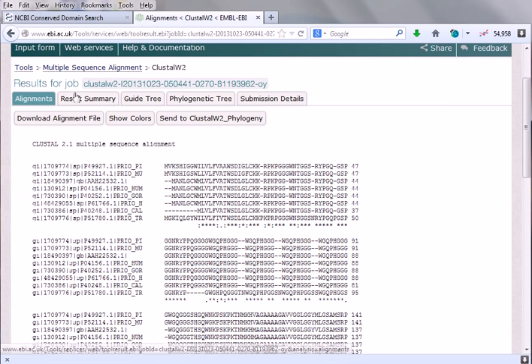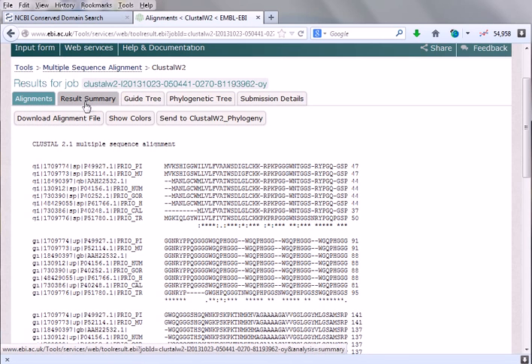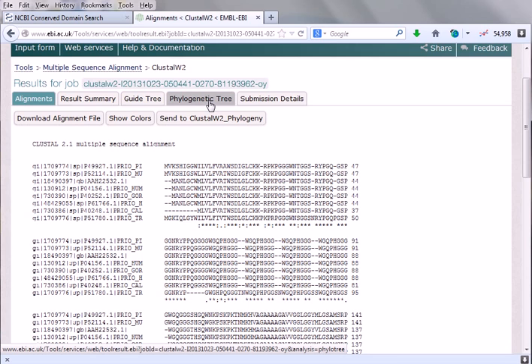This is the alignment results and lots of different tabs are there: result summary, guide tree, phylogenetic tree. So we can construct phylogenetic tree with this multiple sequence alignment. This multiple sequence alignment is a very important tool to construct phylogenetic tree.